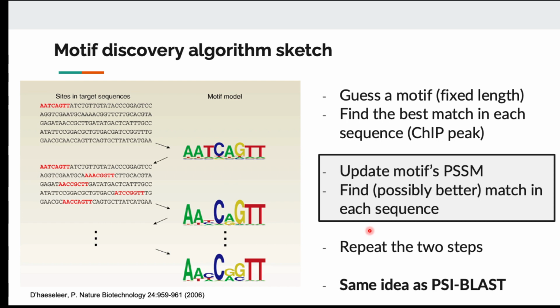In the case of DNA motif, we want to identify a common pattern that occurs in every sequence, starting from something we have no idea about. And then hopefully, as we search more and more, and refine the frequency table more and more, we should converge to a certain answer. So this is the idea. We just repeat the searching and refining the frequency table over and over.